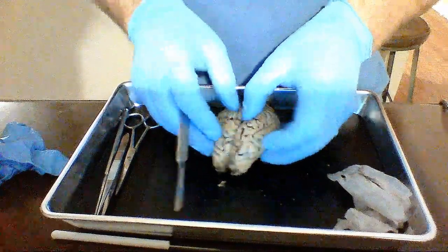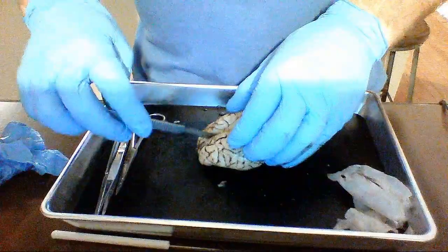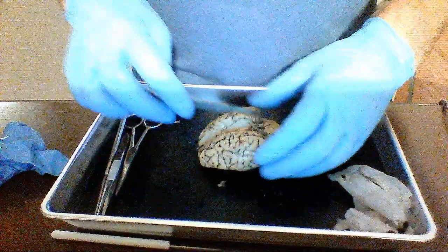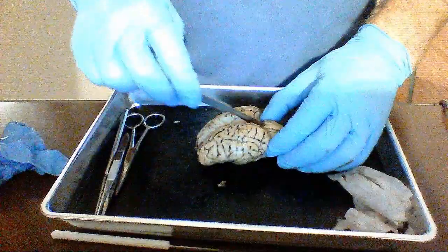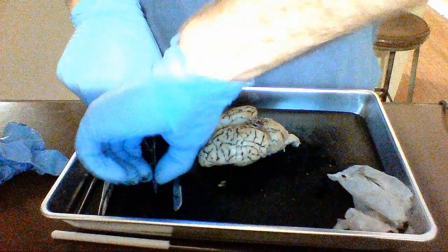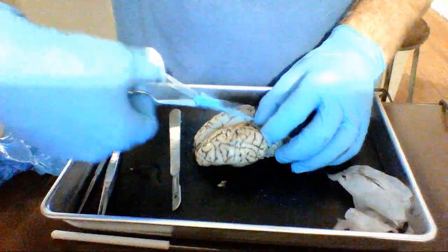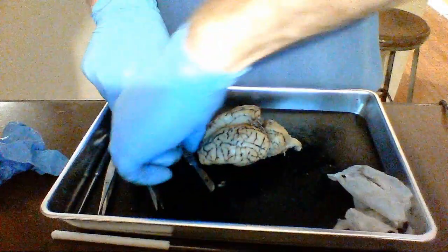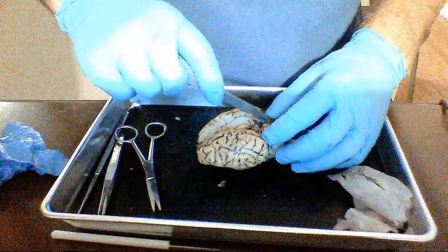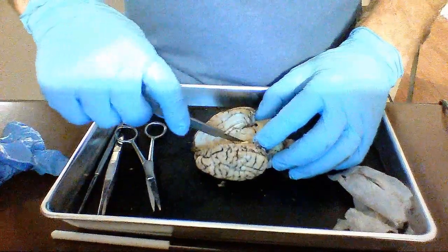So now we'll cut through using our scalpel. We can cut through our cerebellum as well. Some blood vessels we're cutting through. The brain, of course, is highly vascularized, has a high oxygen and sugar need to produce ATP and continue functioning.